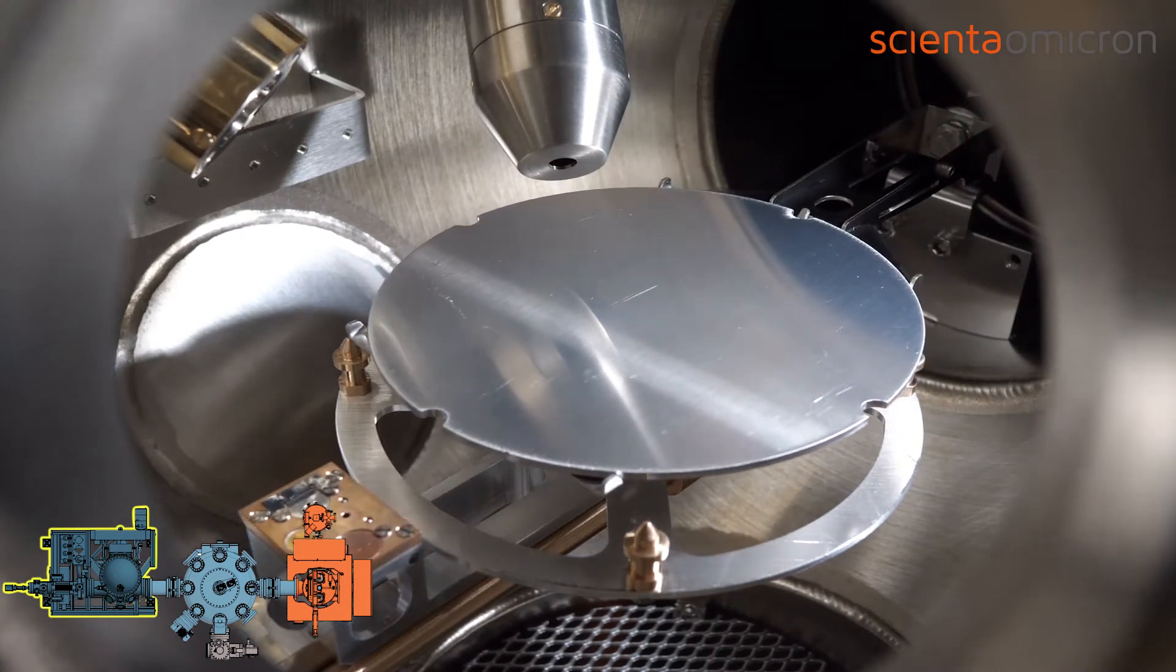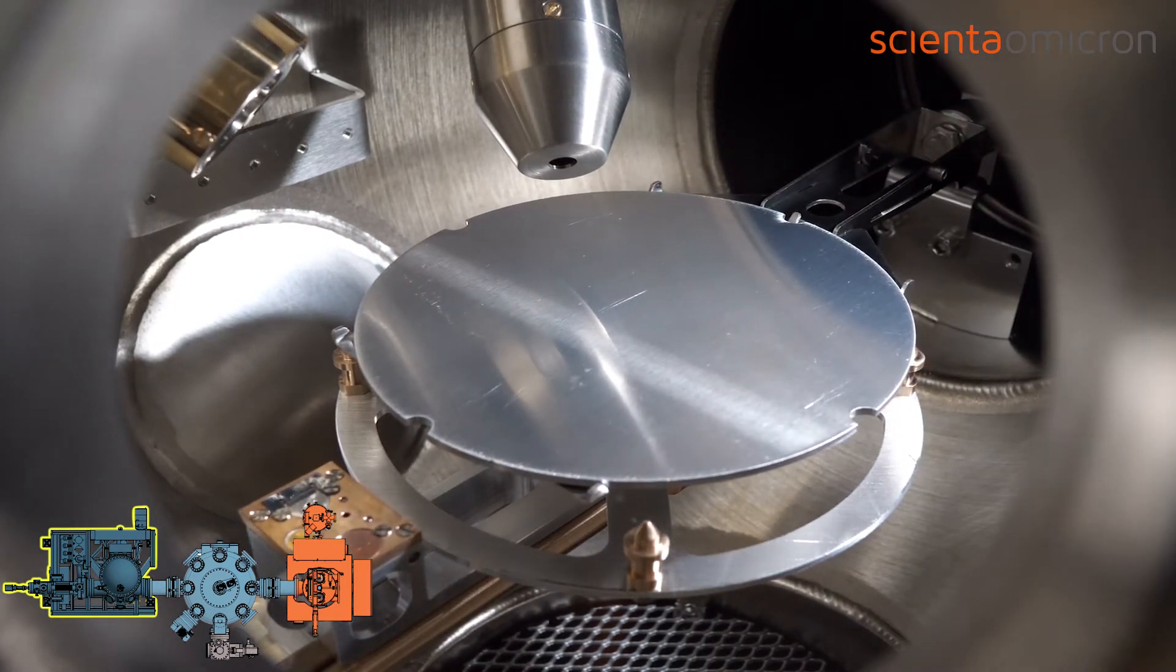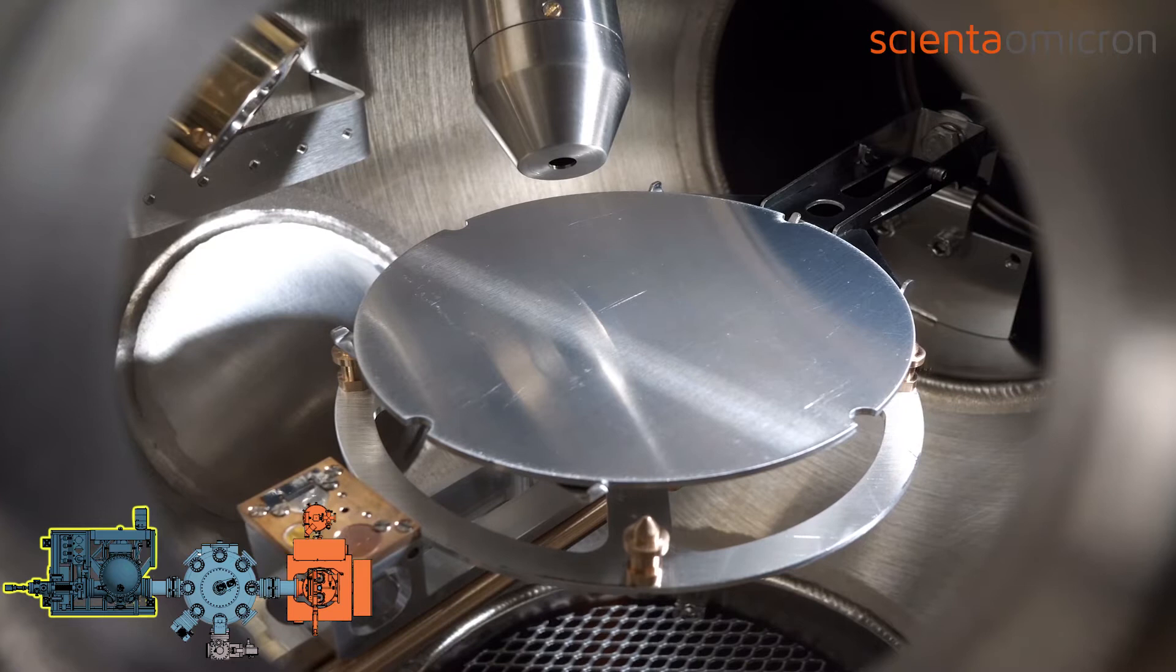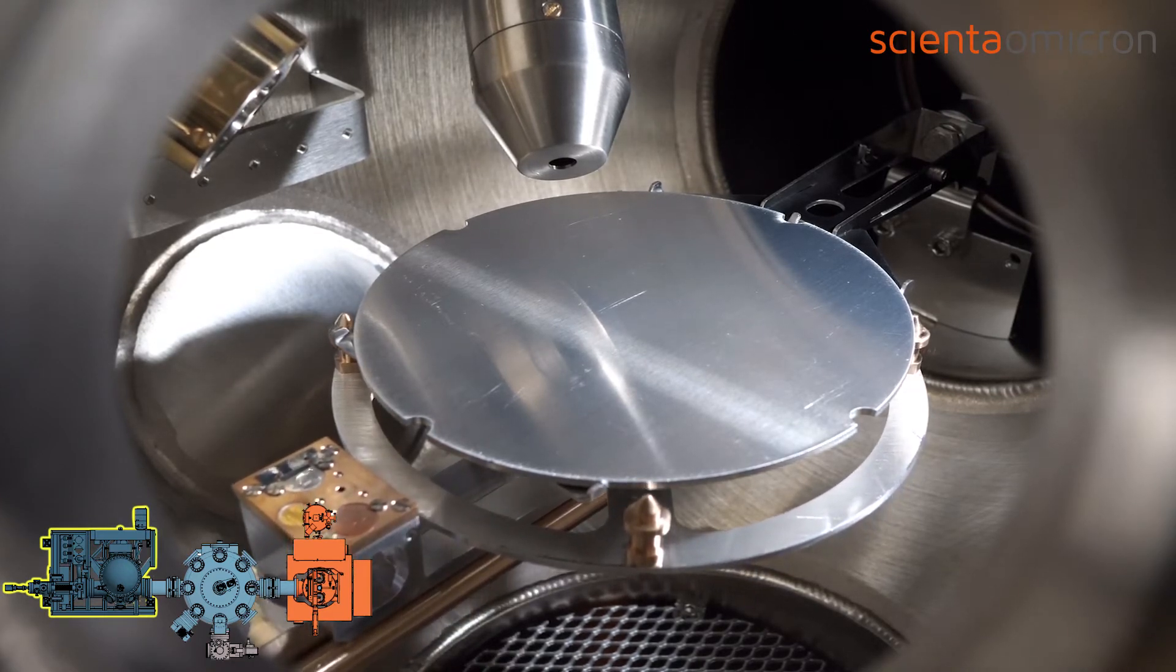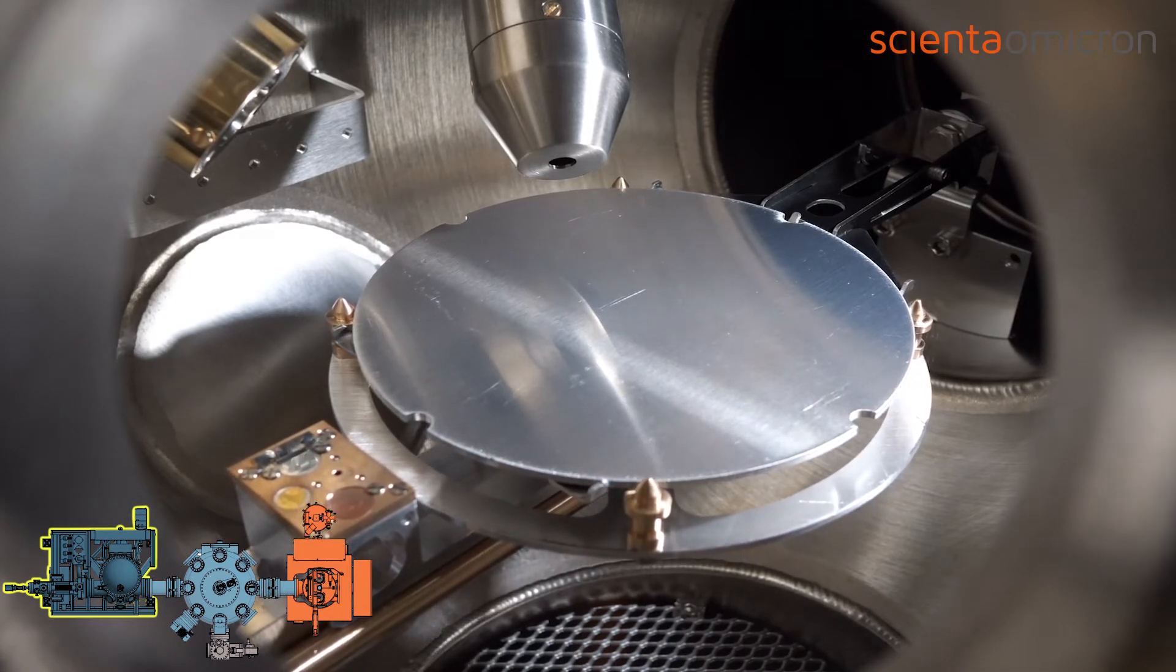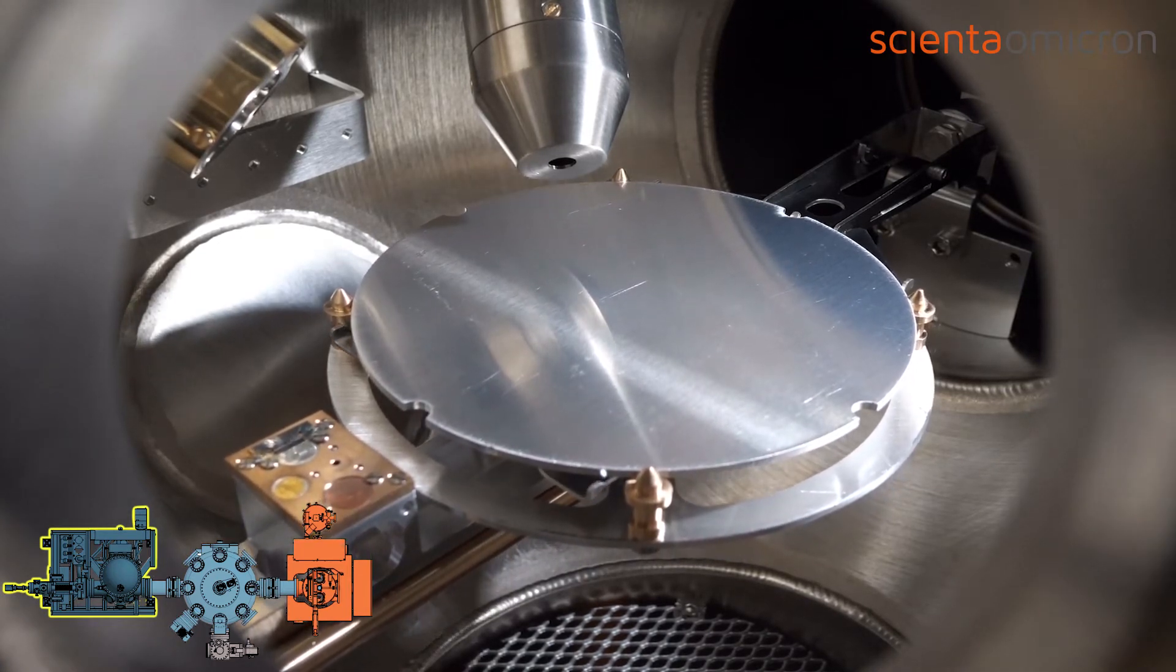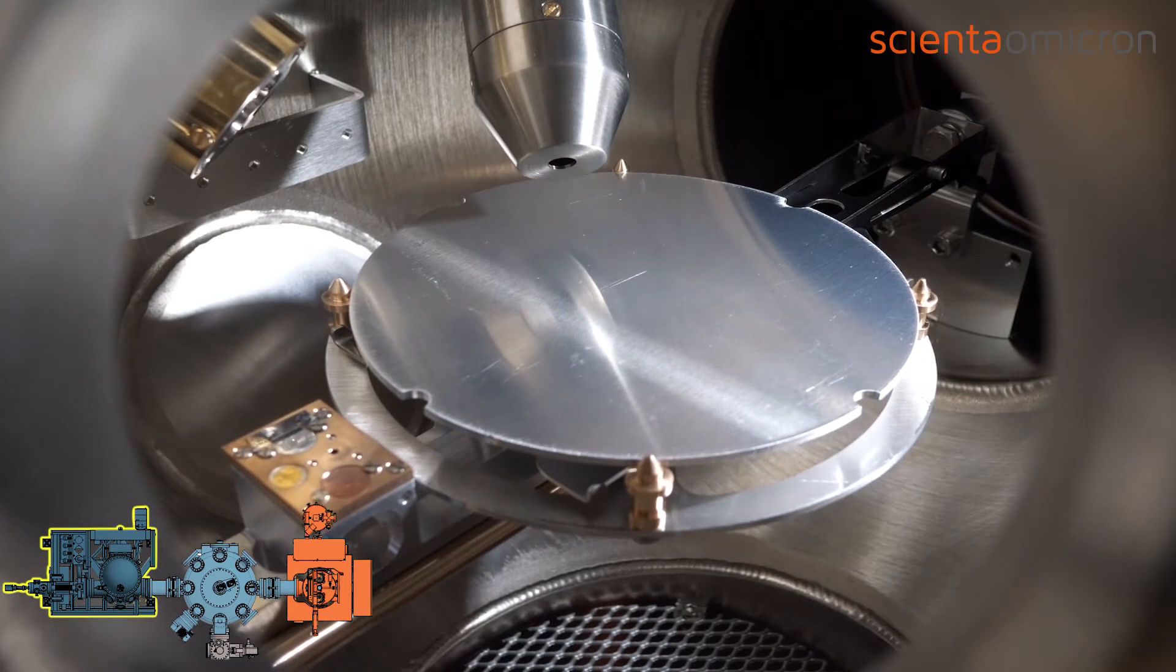After confirmation, the wafer holder is positioned above the manipulator. Then, the XPS manipulator is lifted in order to hand over the wafer holder from the fork acceptor.